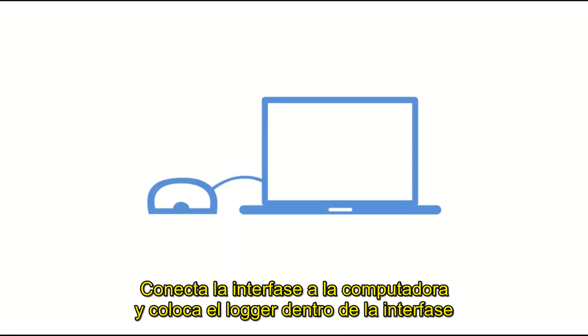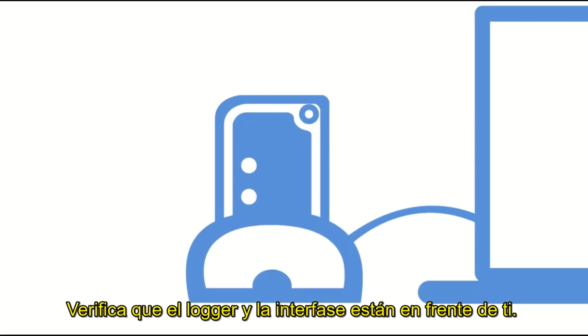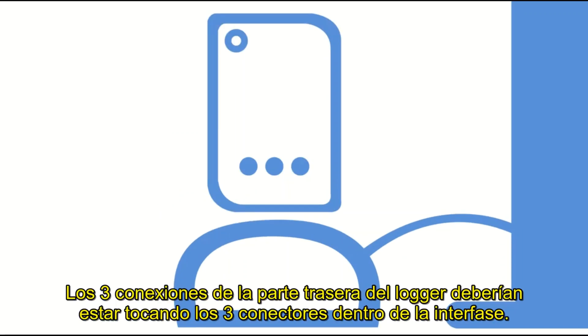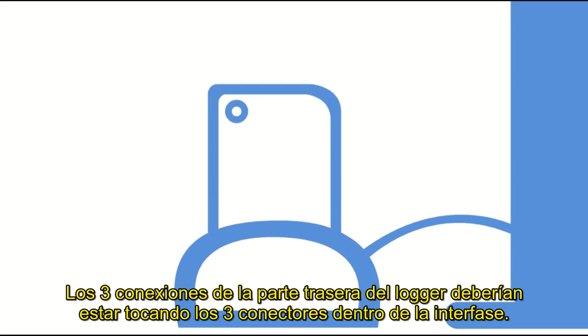Connect your interface cradle to your computer and place your logger into the cradle. Check that both the cradle and the logger are facing you. The three contacts on the back of the logger should be touching the three pins inside the cradle.